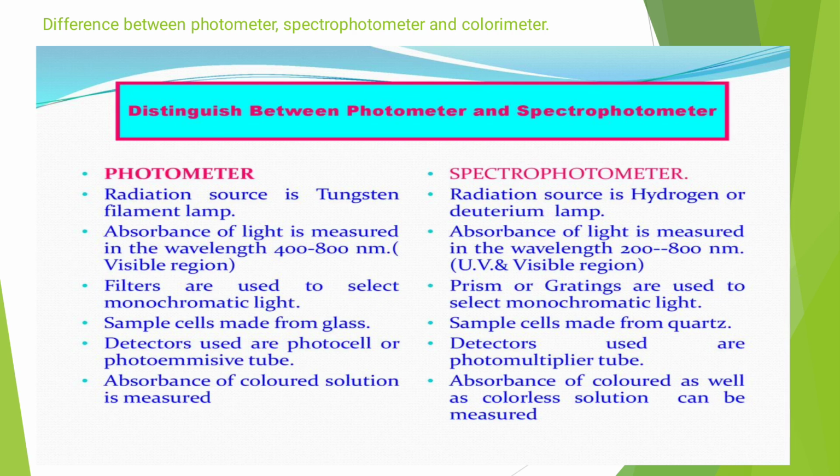The next point is the difference between the photometer, spectrophotometer, as well as the colorimeter. What is a photometer, what is a colorimeter, and what is a spectrophotometer? We will see in the next lecture.